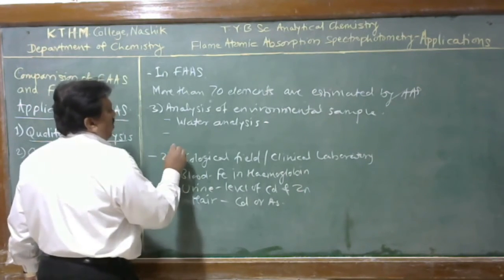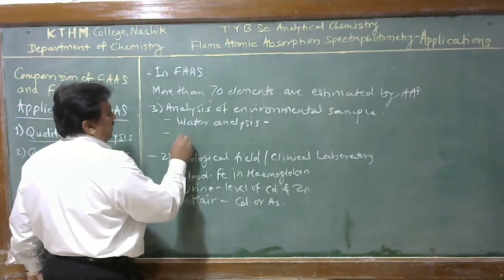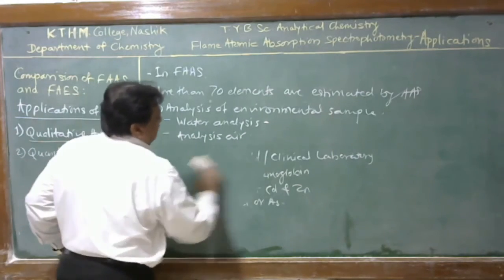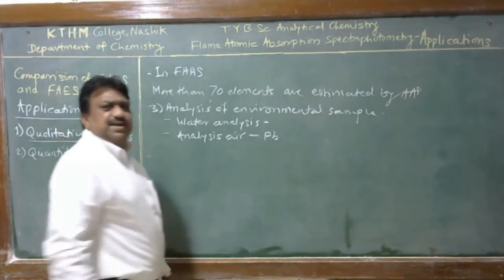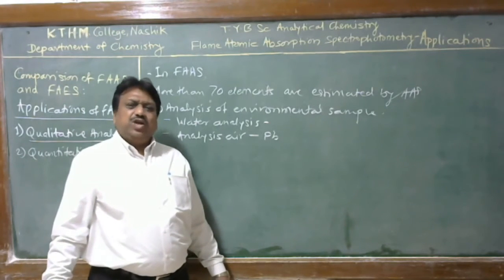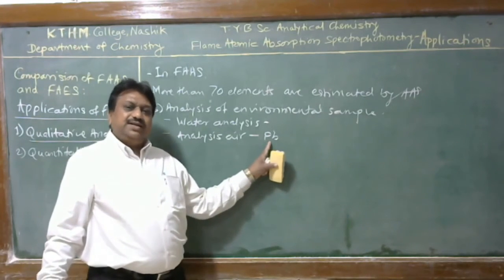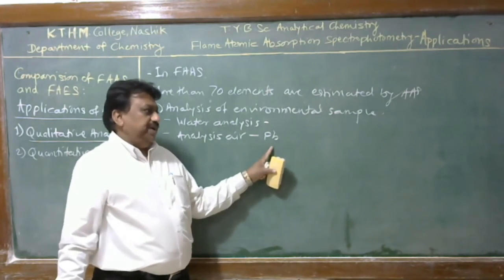Similarly, it is useful for determination of some heavy metals in air samples. Air is analyzed for determination of lead, because lead particles are given off from automobile exhaust. Therefore, the concentration of lead in air can increase, and lead concentration can be determined at a trace level by using flame atomic absorption spectrophotometry.